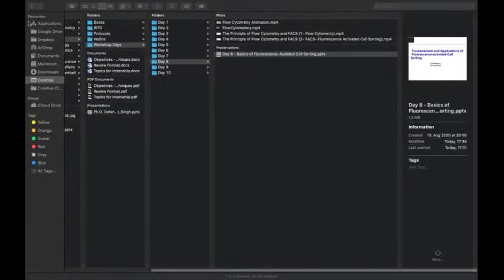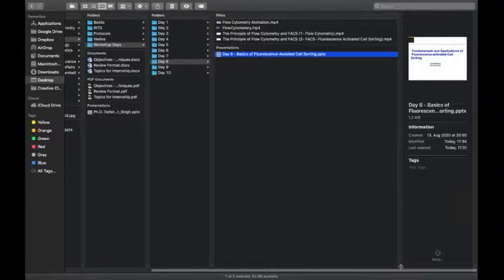Now I will take you to the exciting part of FACS analysis, where you will learn whatever I have told you, that you can differentiate by forward scatter and side scatter, and also with fluorescence. Now we will learn them with nice diagrams, nice pictures, and this nice animation video.